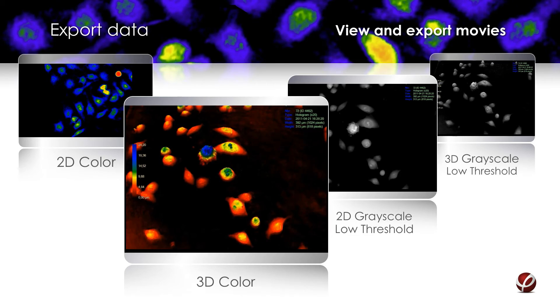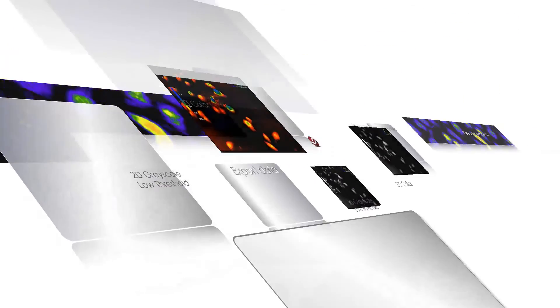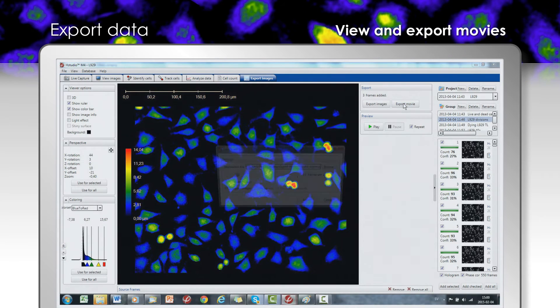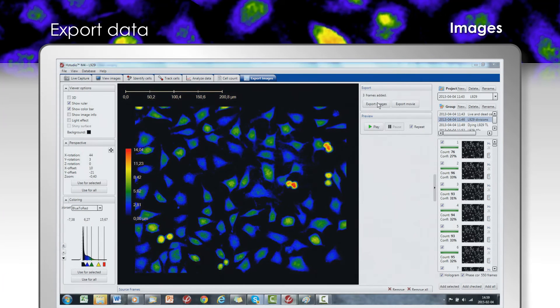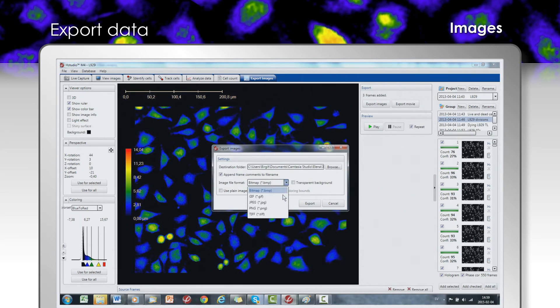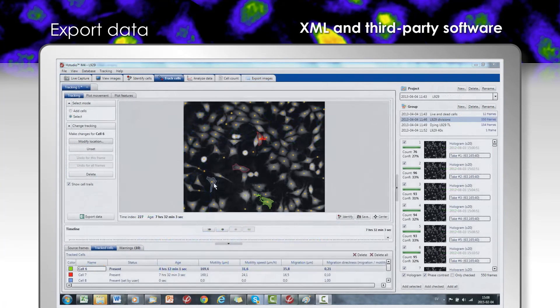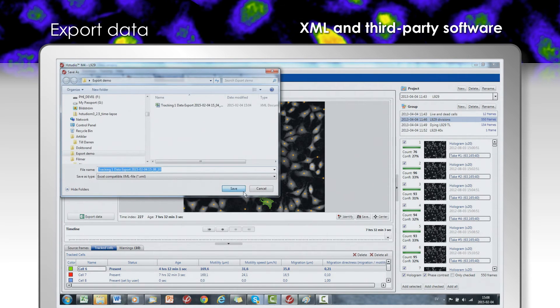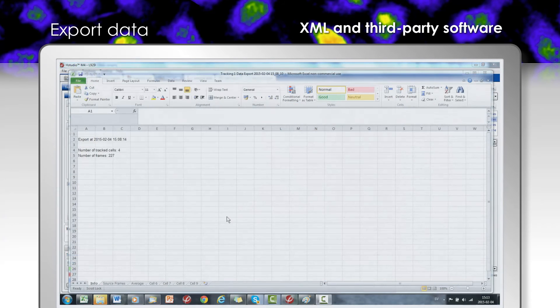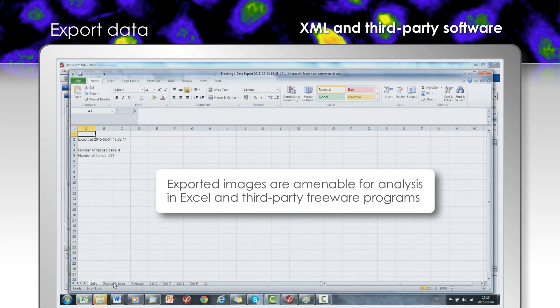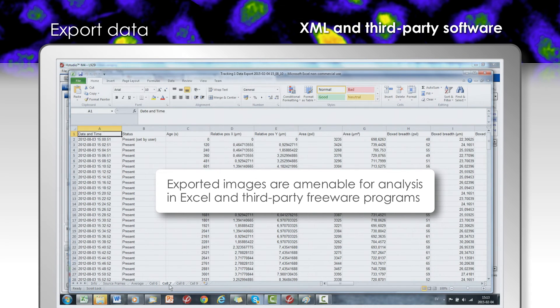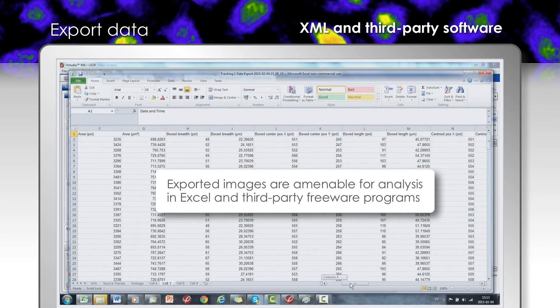Finally, the time-lapse movies can be viewed and effortlessly exported, a functionality beyond the capabilities of many alternative systems. The acquired images can be easily saved in common image file formats. Additionally, data can be exported as XML or to Excel for further analysis. As an extra added benefit, the images can be easily processed in multiple freeware programs.